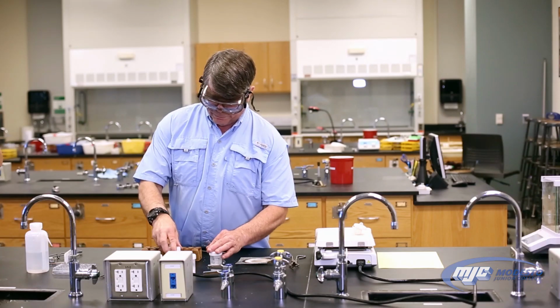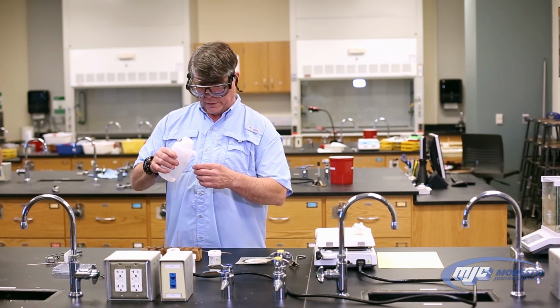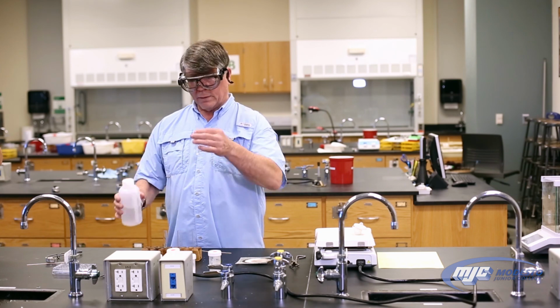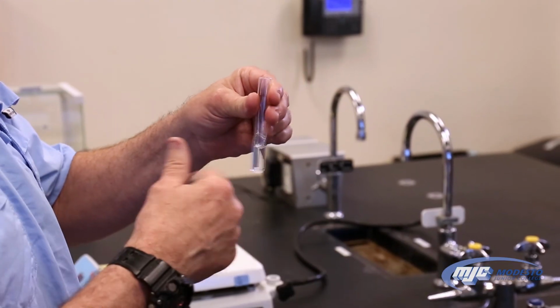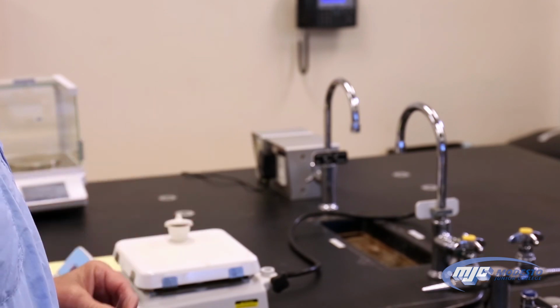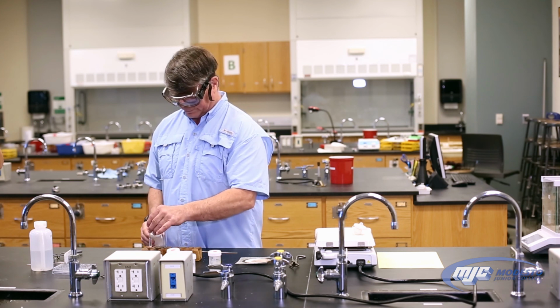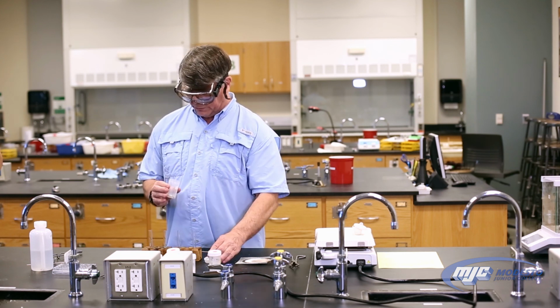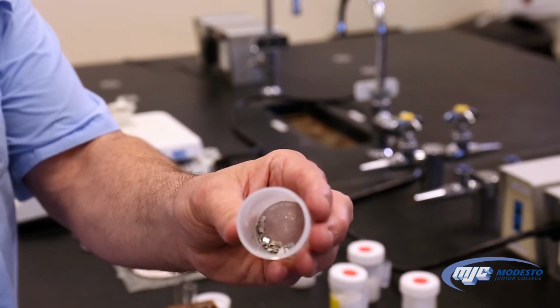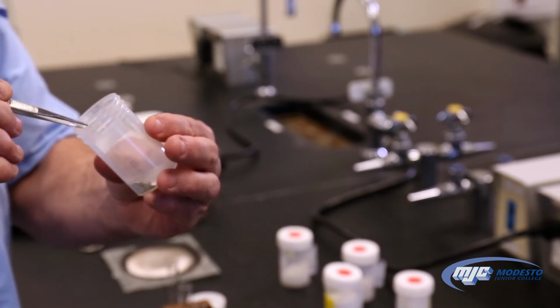So once we put our unknown into the test tube, take some deionized water and fill it up, about that much. Give it a few flicks, help it start to dissolve. Doesn't matter if it all dissolves or not. And then we're going to take a piece of magnesium. We don't need much, just one piece. They look like this. And the important thing to see is how shiny they are.